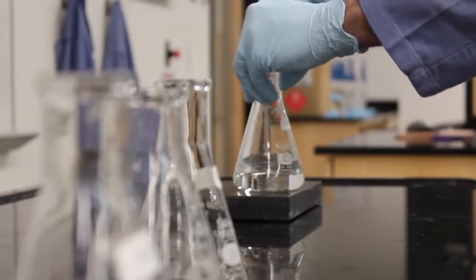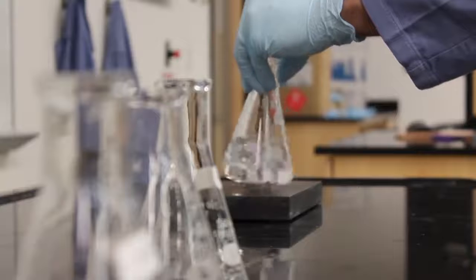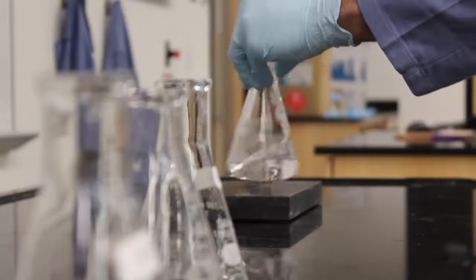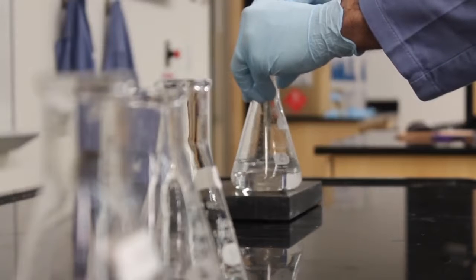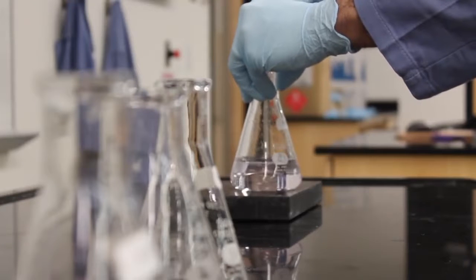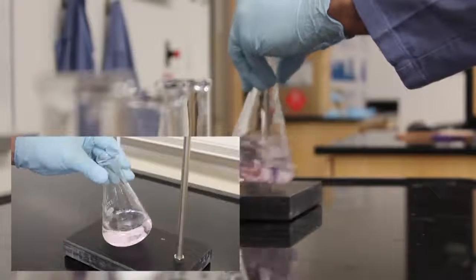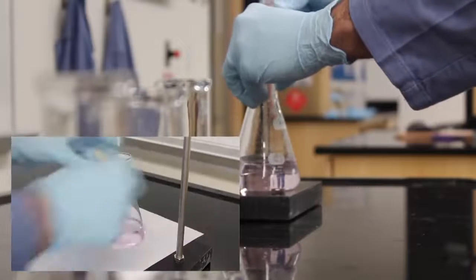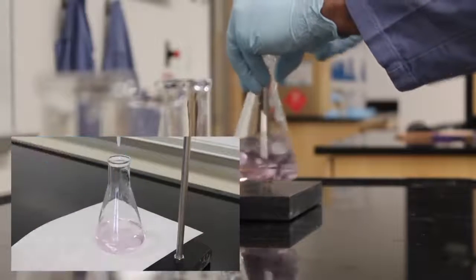This process can take a while, but in order not to go past your equivalence point, you need to take your time. Adding your titrant dropwise and stirring intermittently will ensure the best results. Adding a sheet of white paper under the flask can help you see the color change if the black background of the ring stand makes it difficult for you to see. A pale pink is the color that you are aiming for.